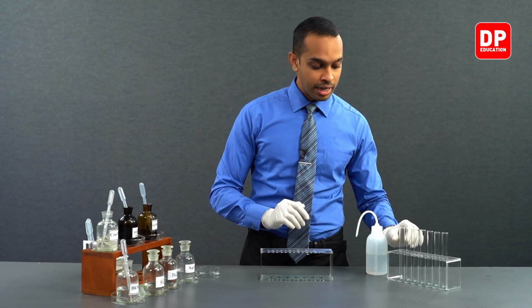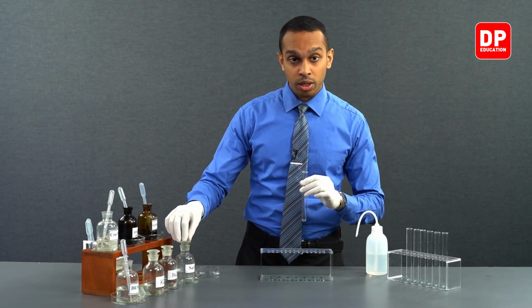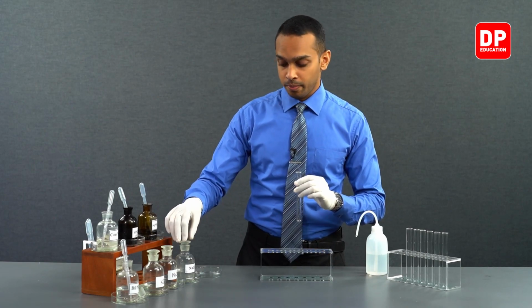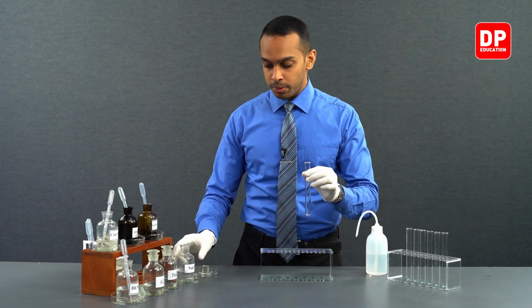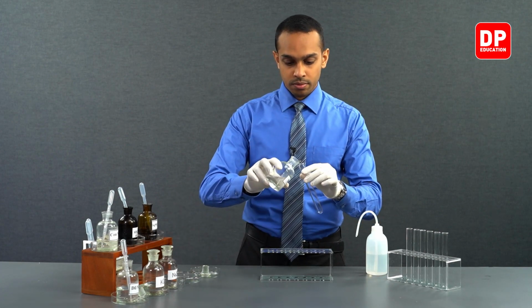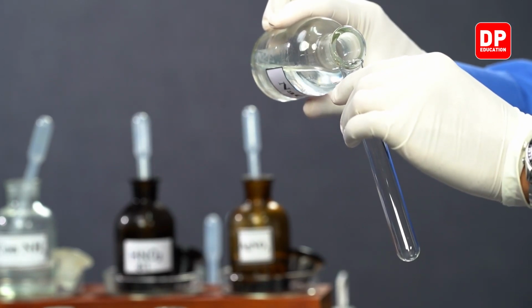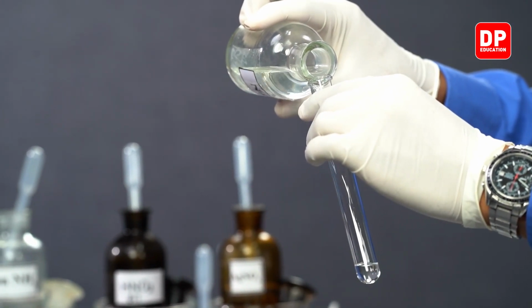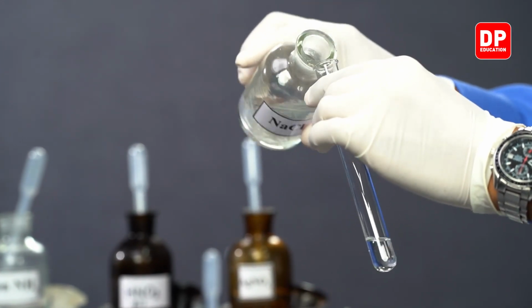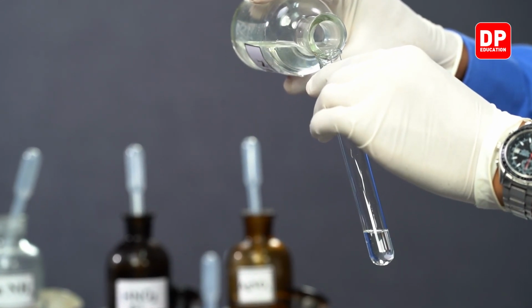So let's take a little bit of sodium chloride solution and transfer it into a test tube. In the sodium chloride solution, you will have sodium ions and chloride ions. We are testing for the chloride ions in this solution.